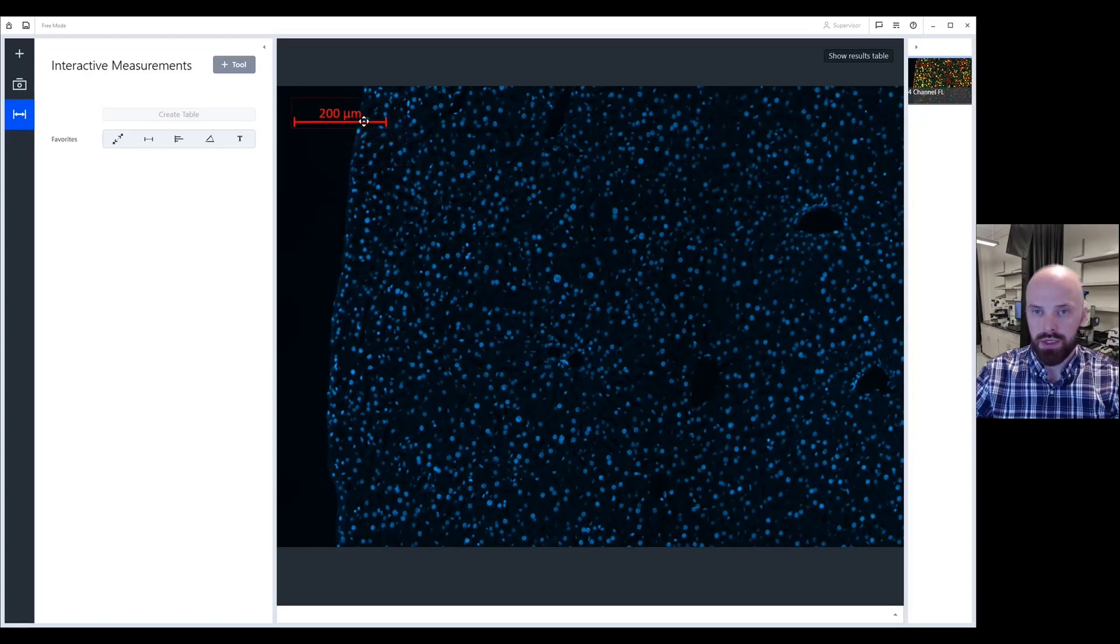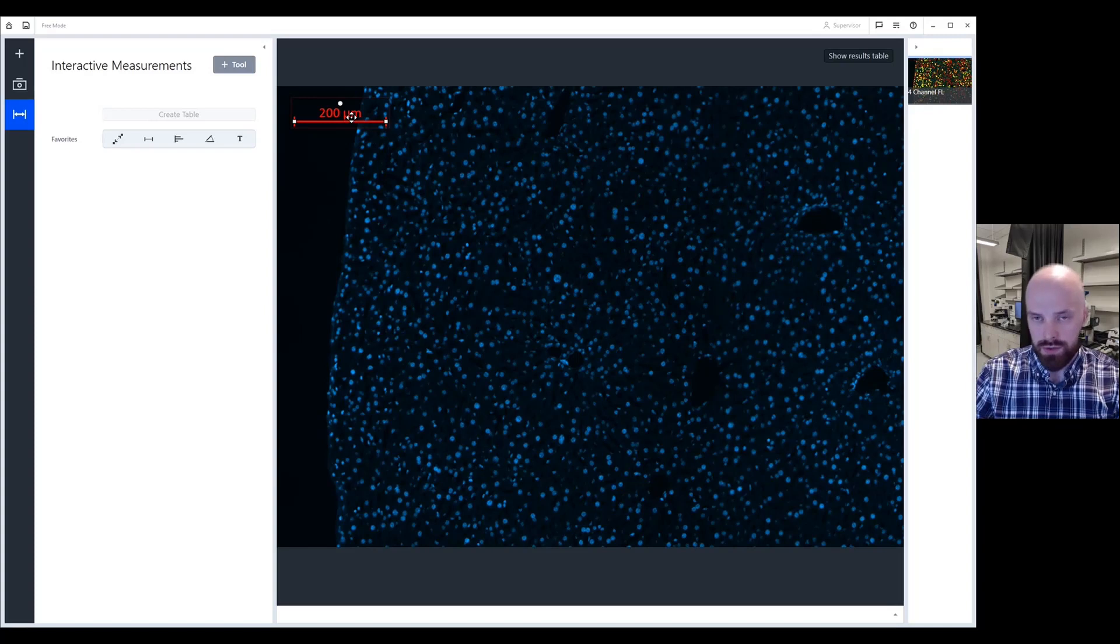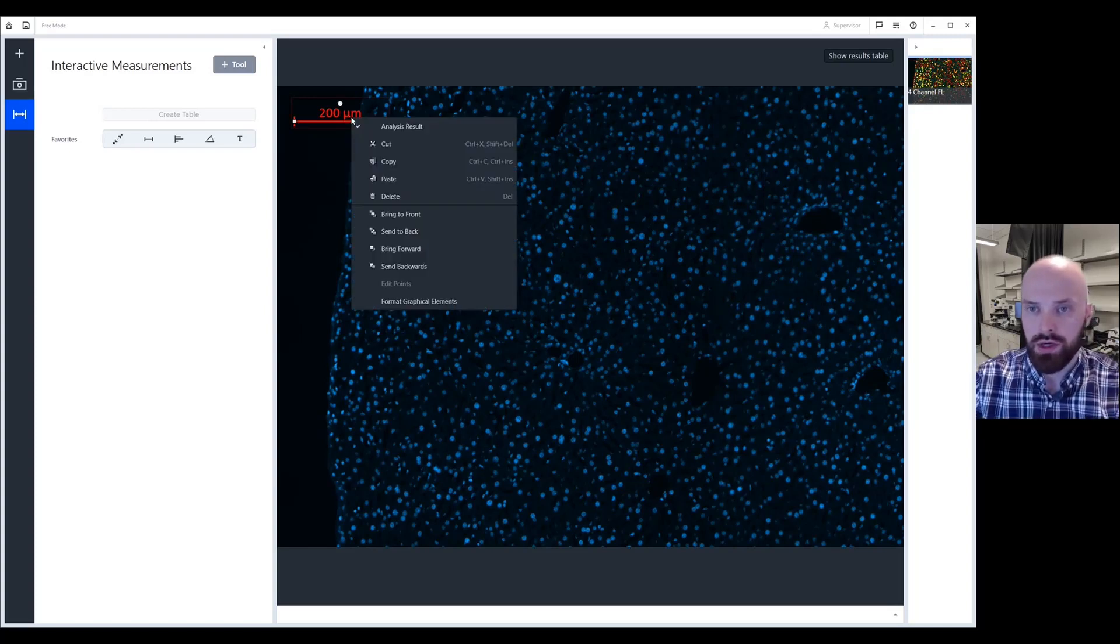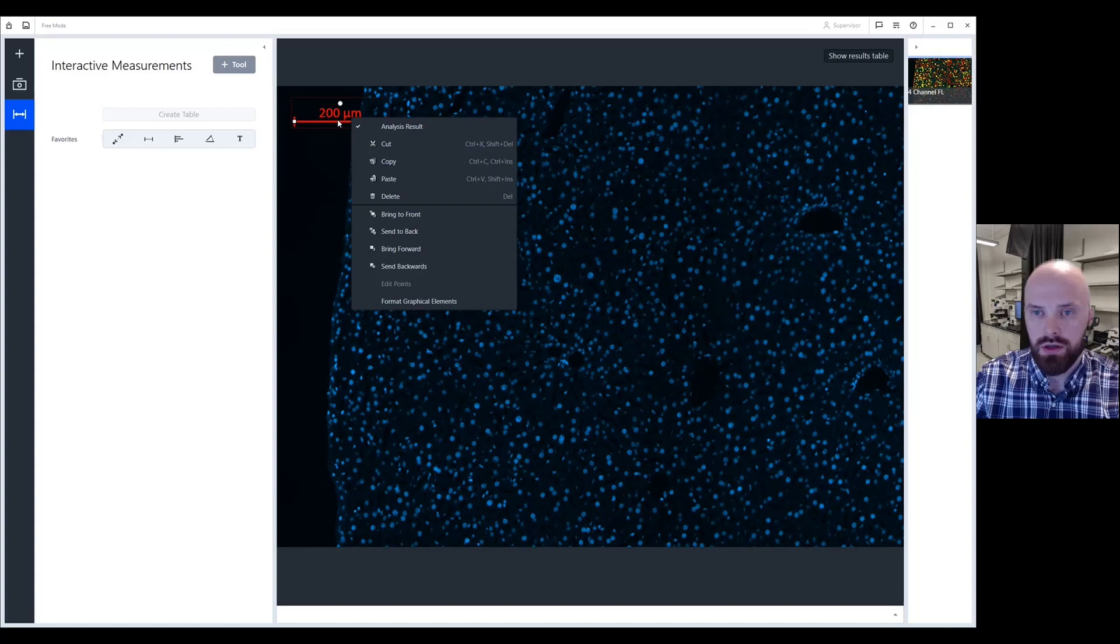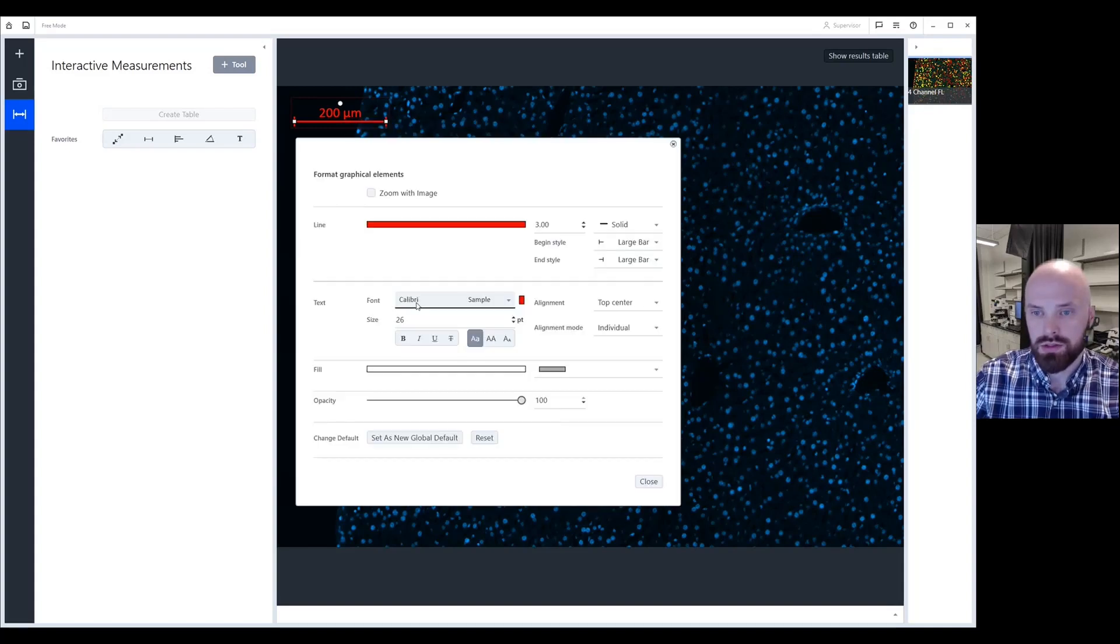Once I'm happy with the location of my scale bar, let's say I want to change the color as well as the formatting. So what I could do here is if I right click the scale bar and I scroll down to format graphical elements, what you'll then see is a format graphical elements window appear.